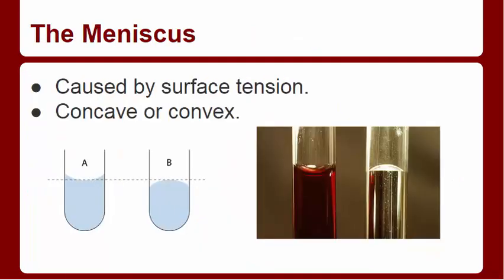Very good. So when you're measuring the liquid in a graduated cylinder, you might have noticed that the liquid starts to kind of stick to the edges. This is because of surface tension, and this shape that looks like a belly is called the meniscus. It's not like the one you have on your knees. It's a different meniscus, the one we use in chemistry.